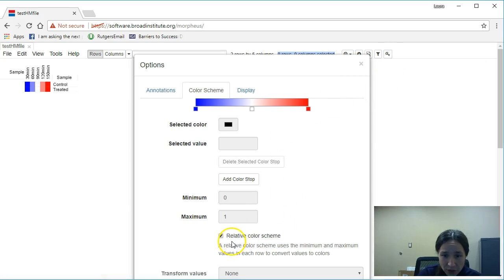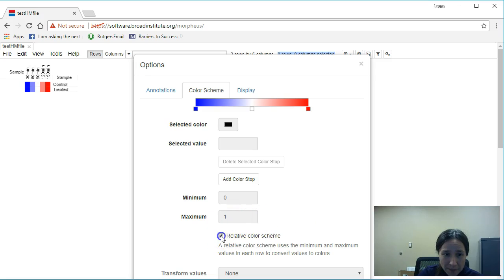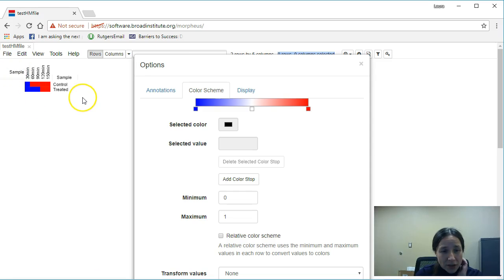So first off, we need to remove relative color scheme. As you notice, it's already gone ahead and changed the colors of your heat map.